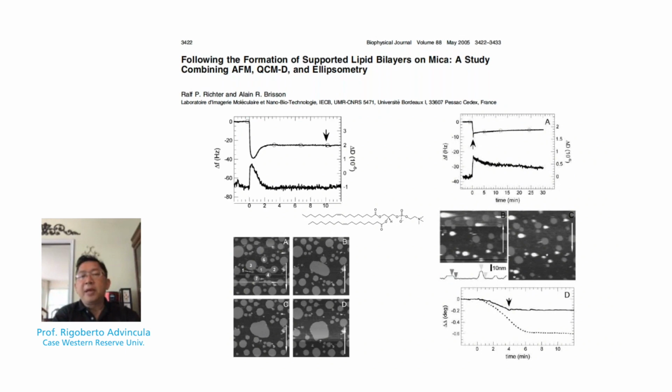Now, if you go directly to the paper and investigate their conclusions, what they have found is that together with AFM, the formation of larger domains of the lipid bilayer coincided with the equilibrium or rearrangement of the lipid bilayers once deposited on the surface, but does not show a measurable change either by dissipation or frequency shift.